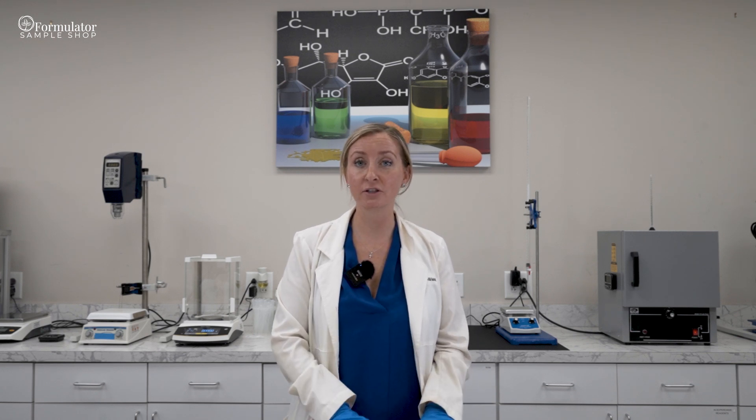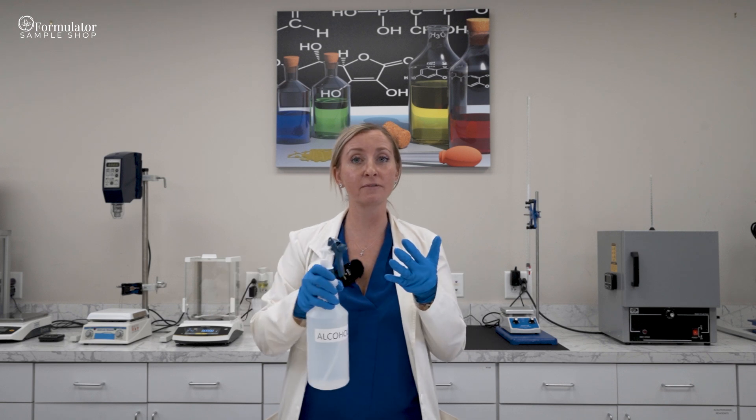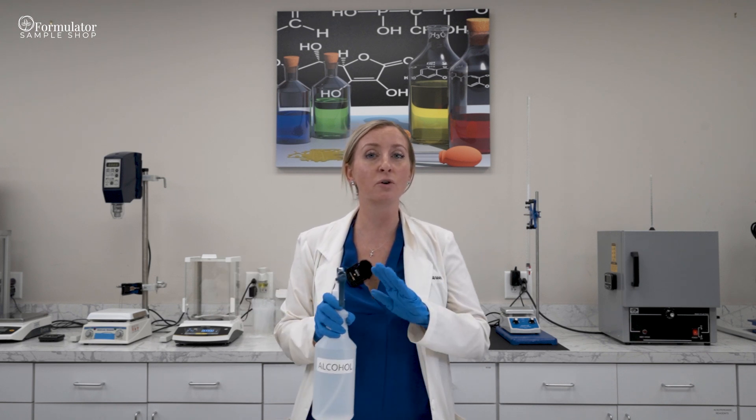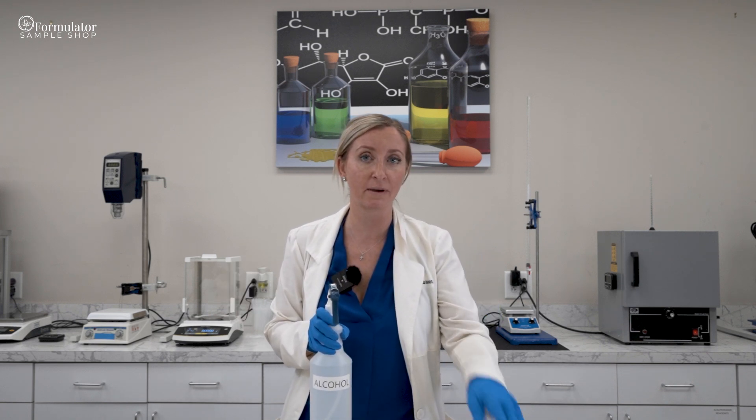Once you're done sterilizing all of your lab equipment and before you start your batch, you always want to make sure that you spray your PPE as well. So you would use your 70% alcohol solution and spray your gloves thoroughly. That way you make sure that you don't contaminate anything by touching the batch with your dirty gloves.